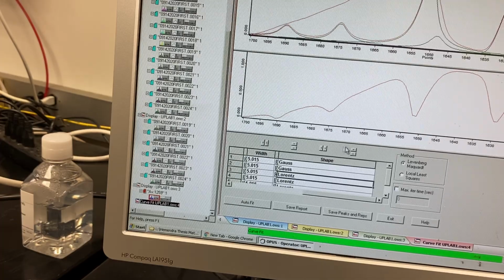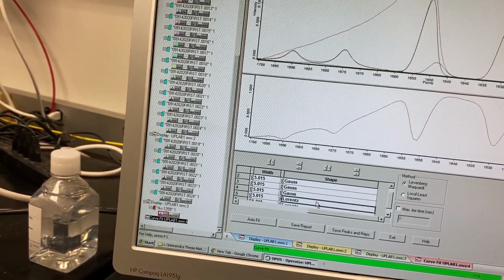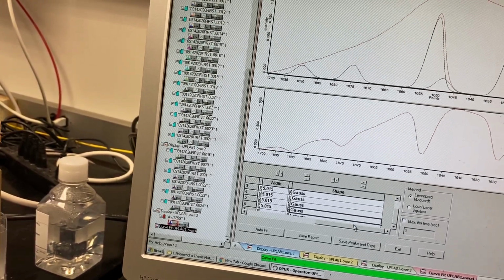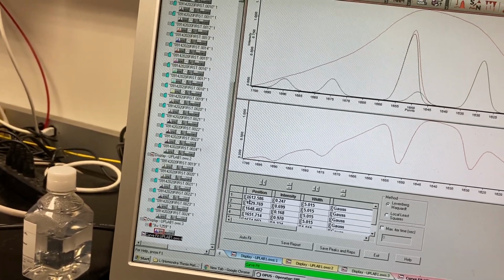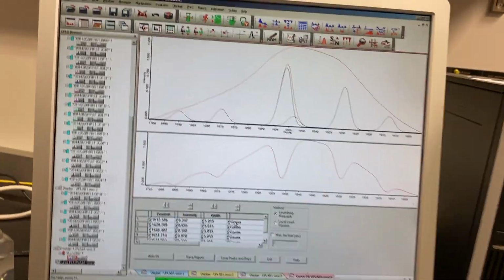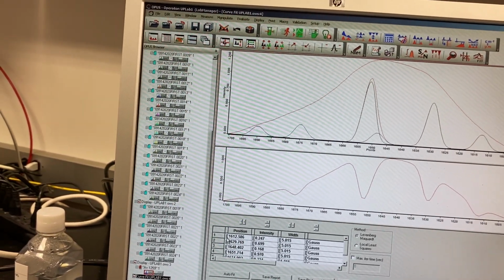People call it Gaussian, or normal distribution, whatever, if you don't understand the Gaussian. All the science, all the statistics should follow the normal distribution. So molecular vibration also follows the normal distribution. But if there is an overlap of vibration, if you are doing the fitting without the rubber band correction, then you have to use the Lorentzian distribution.